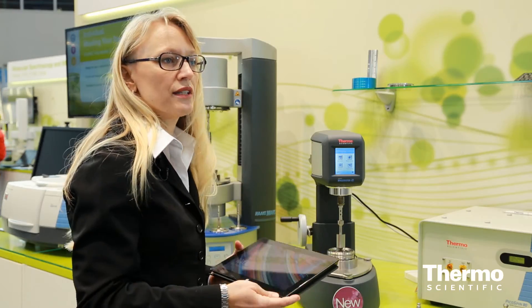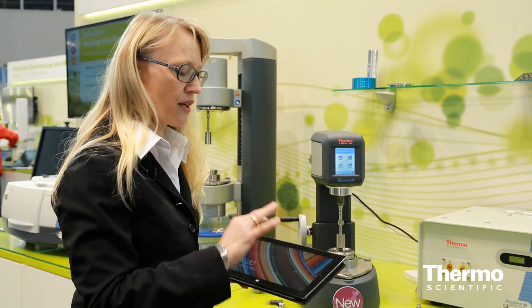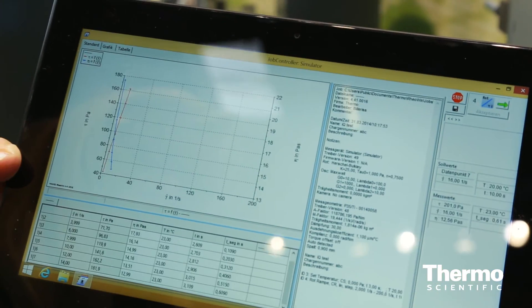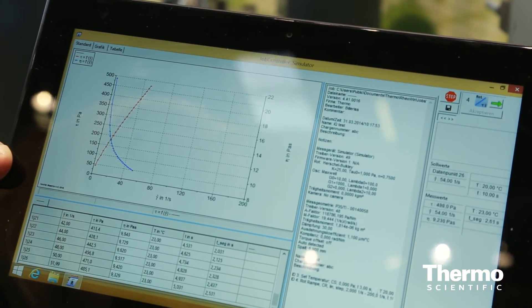Version number three is the Haake Visco Tester IQ Reo software for complete software control of the instrument. You can download a measuring and evaluation routine on a computer and by double click the measurement starts.